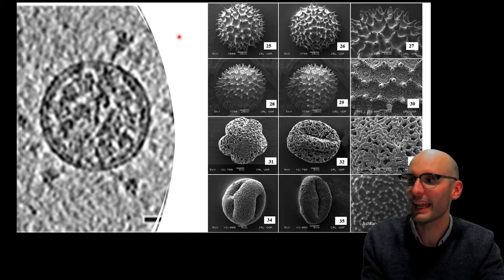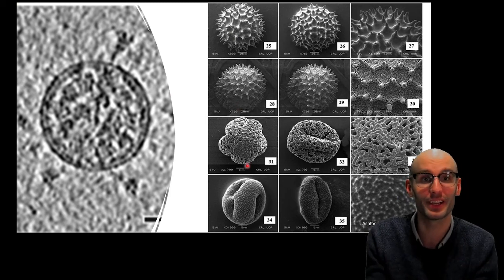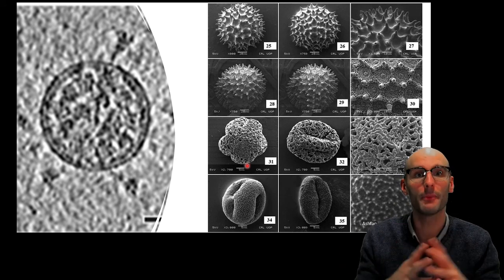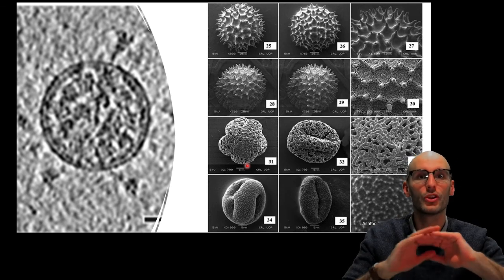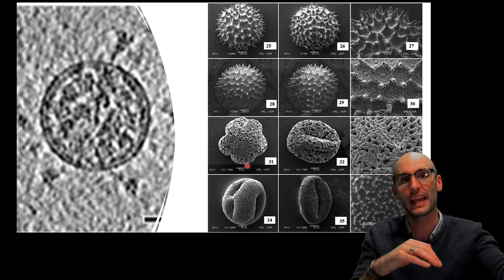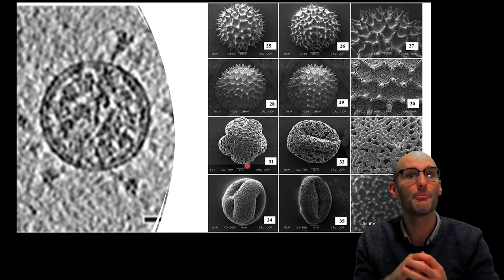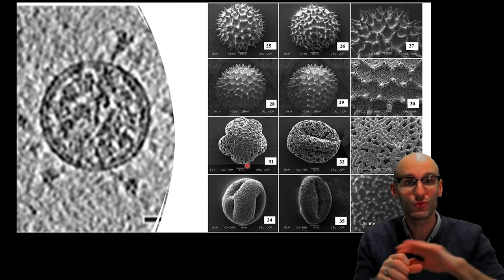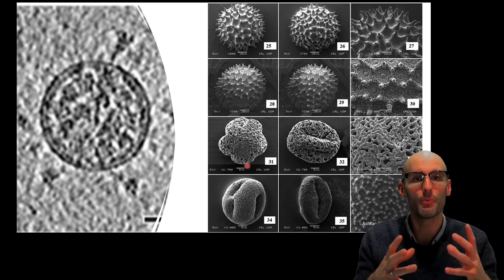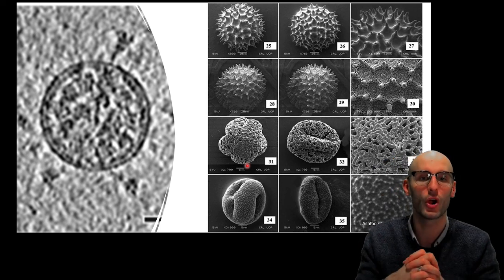And this scanning electron microscopy is where we get these absolutely beautiful surfaces. It doesn't have to be a thin section anymore like a transmission electron microscope. We can actually pick up surfaces. Now what we do sometimes, because perhaps the surface that we're trying to look at isn't very good at scattering electrons, so instead of scattering, the electrons just go straight through it, sometimes we coat the sample in a heavy metal like gold. We coat it in really fine gold. Gold, being really heavy and dense, is excellent at scattering the electrons. So now we can see it.